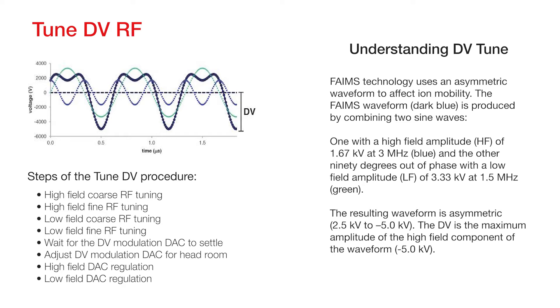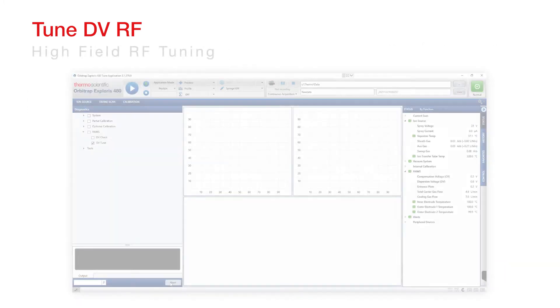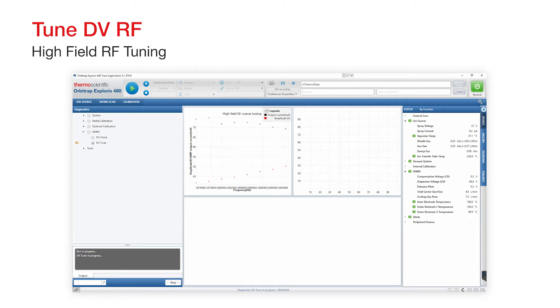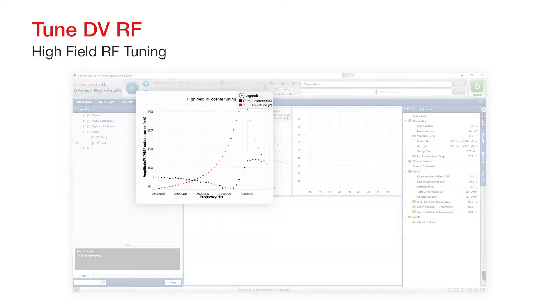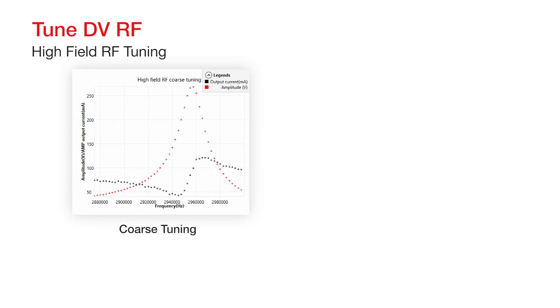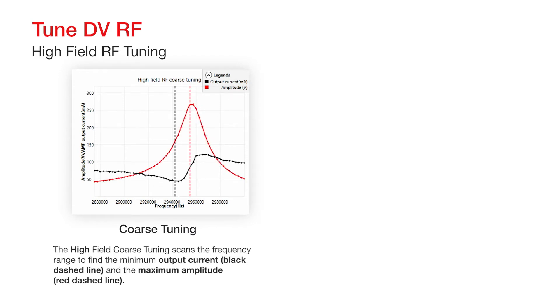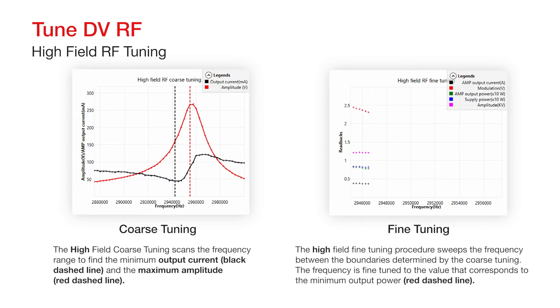The DV is the maximum amplitude of the high-field component of the waveform. Every RF circuit has an ideal resonance that doesn't waste power. High-field RF tuning determines the high-field frequency that corresponds to the minimum output power. The high-field coarse tuning scans the frequency range to find the minimum output current, shown here as the black dashed line, and the maximum amplitude, shown as the red dashed line. The high-field fine-tuning procedure sweeps the frequency between the boundaries determined by the coarse tuning. The frequency is fine-tuned to the value that corresponds to the minimum output power, shown here as the red dashed line.